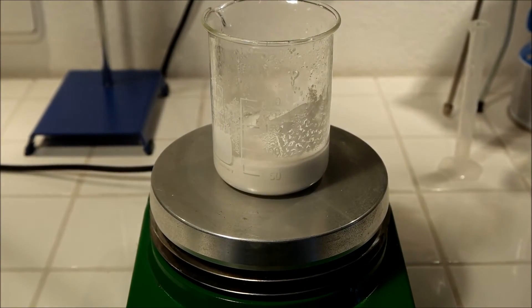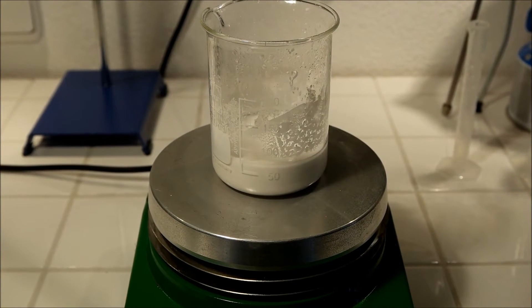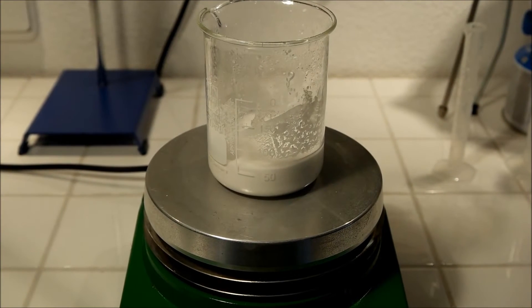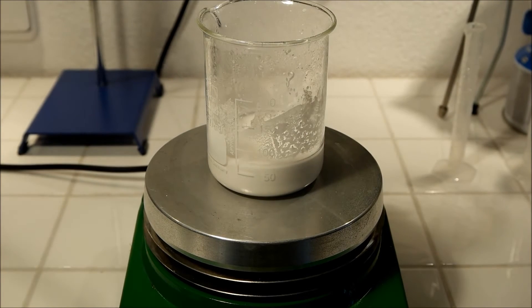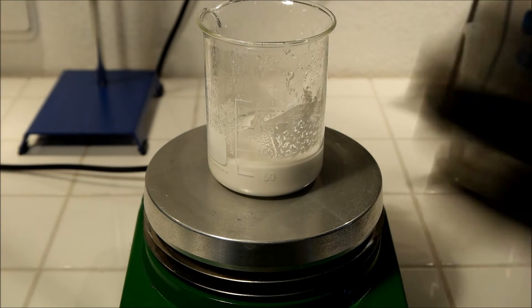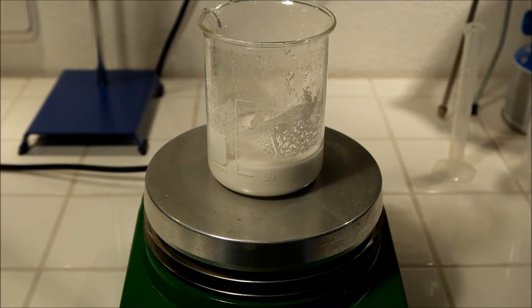That's how the beaker looks after the reaction is completed. If my calculations were right, then everything should have reacted. So there's no HCl in it and no barium carbonate, just barium chloride and 50 grams of it. But that's only a theory. I don't think that it worked that good.